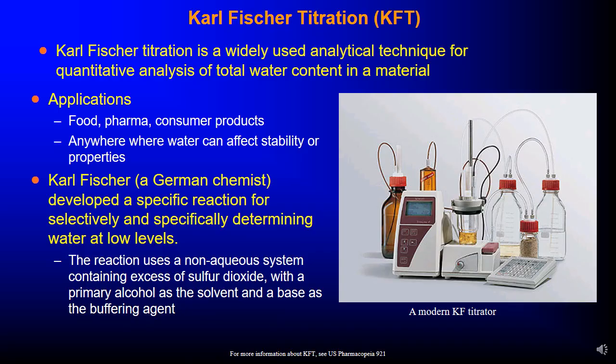Then Karl Fischer titration is a widely used analytical technique for quantitative analysis of total water content in a material. So some of the applications are in food, pharmaceuticals, consumer products, or anywhere where water can affect stability of properties.